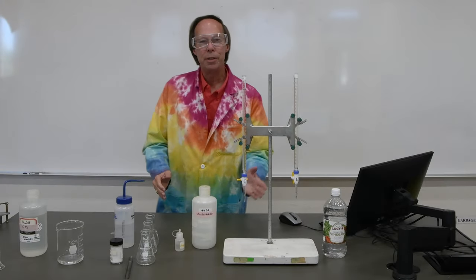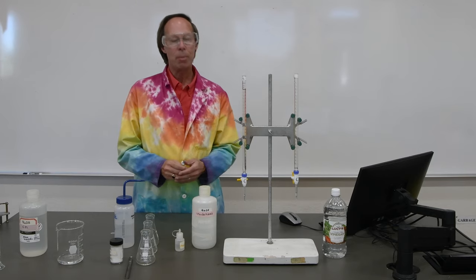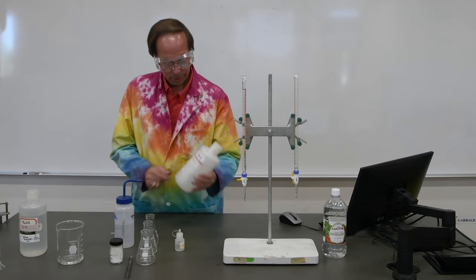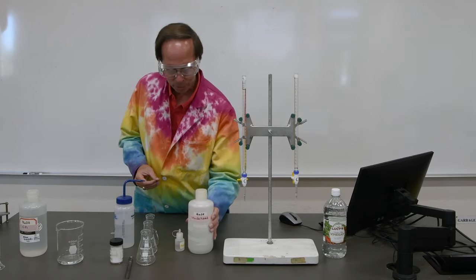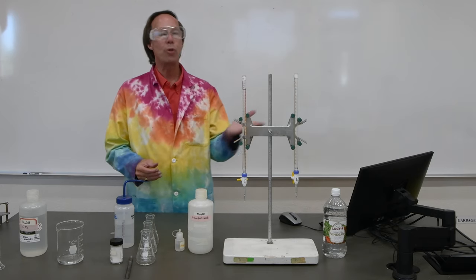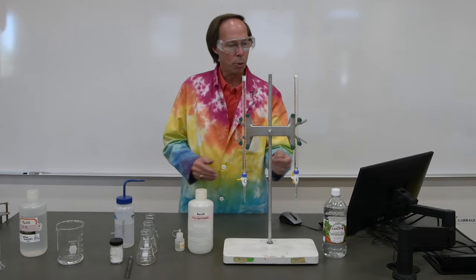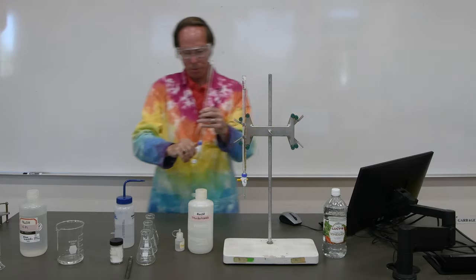Now that we've completed the standardization titrations for our sodium hydroxide, it's time to move on and analyze the vinegar. You will, of course, need to calculate precisely what the molarity of our standard solution is, and in the pre-lab video, I went over in detail how to do that, and you'll also find it in the lab manual instructions as well. So like we did with the first burette, we're going to have to clean and fill this one, but this time with vinegar.